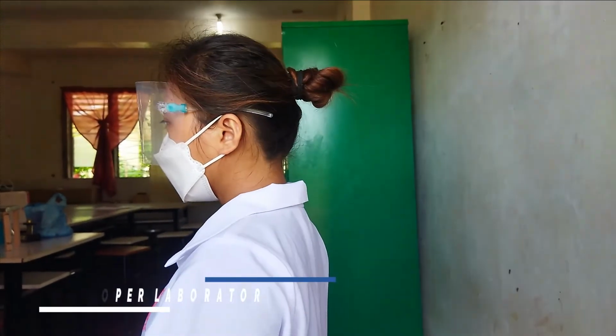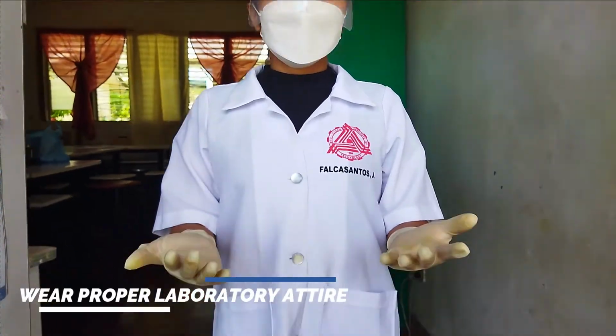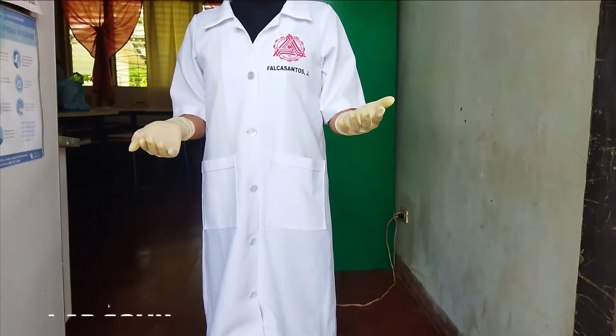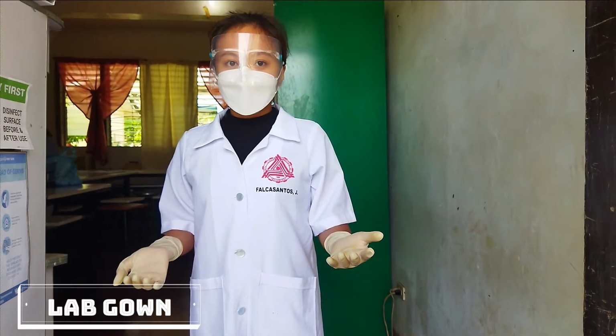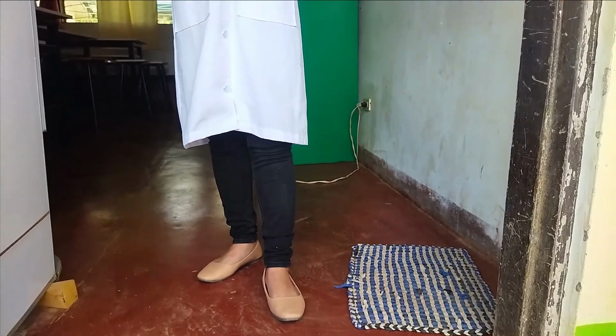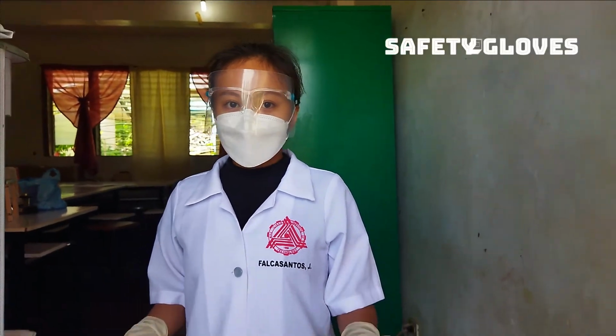First things first, in conducting any experiments inside the lab, we should have our personal protection to ensure our safety. So, we should wear proper laboratory attire at all times. First, and one of the most important to wear is our laboratory gown or laboratory coat. It serves as a barrier that keeps you from being exposed to accidents in the lab. Always remember to wear long pants or skirts and closed-toe shoes, and tie back long hair. Wear safety glasses and appropriate gloves at all times.